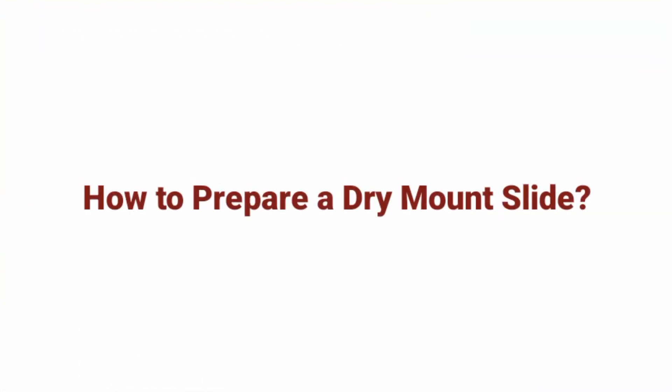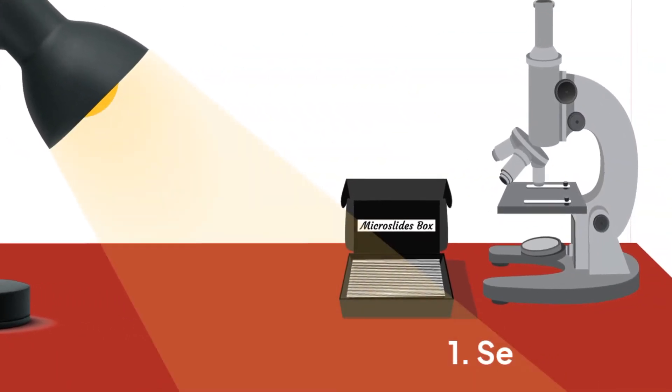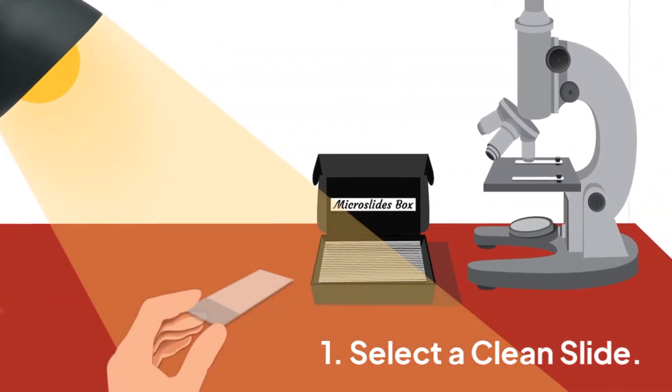How to prepare a dry mount slide. First, select a clean slide which is free from cracks. Do not use tissues or paper towels, as these can leave lint behind.